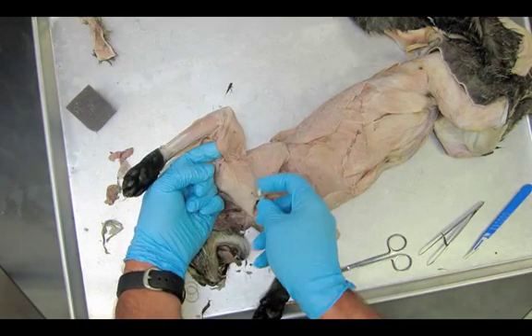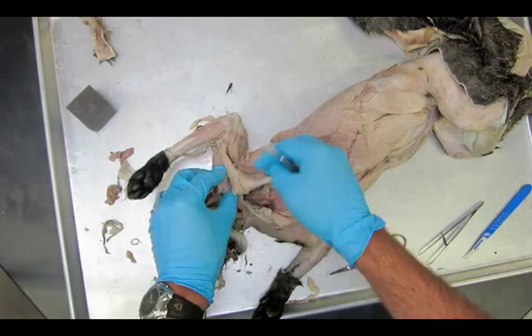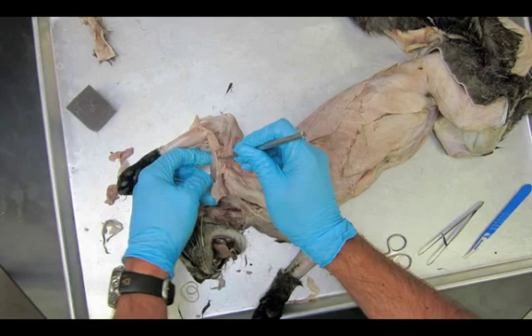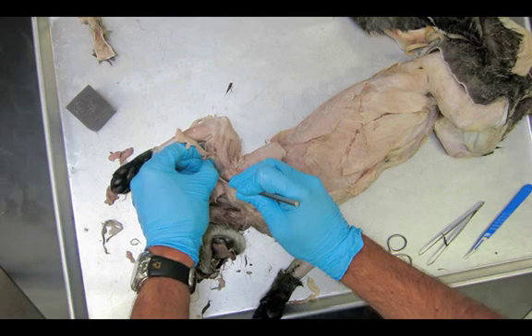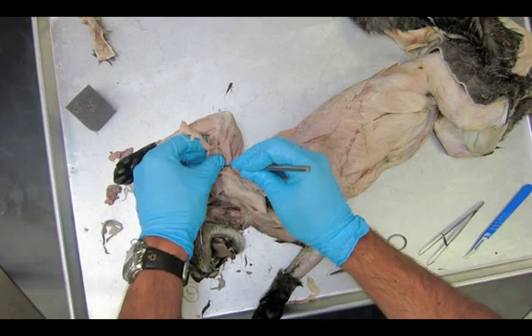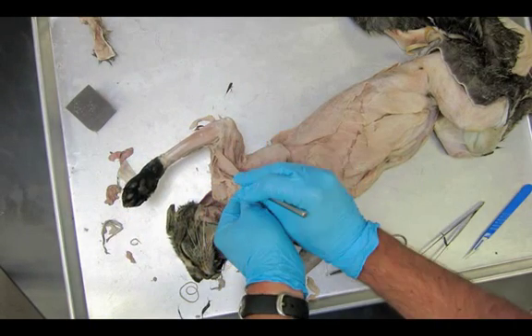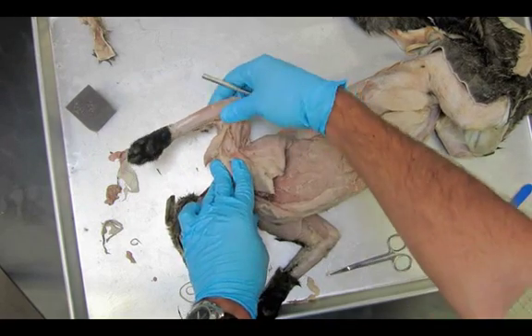I'm going to free up the epitrochlearis so I can move it completely out of the way on one side. Working my way underneath it, we'll see the epitrochlearis really clearly and of course the biceps brachii — we've also seen the biceps brachii when we did the coracobrachialis earlier. Right where my probe is digging, that's where the biceps is going to be. You can see the biceps brachii underneath the pecto-antibrachialis.